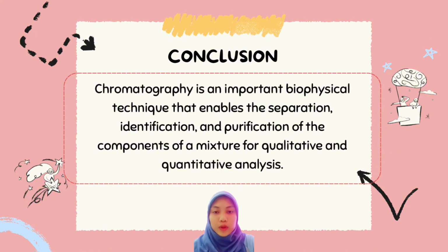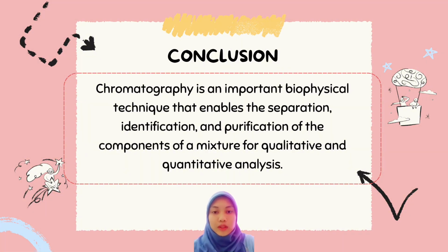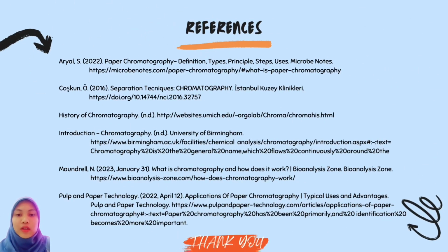Chromatography is an important biophysical technique that enables separation, identification, and purification of the components of a mixture for qualitative and quantitative analysis. And that's all for our slide.